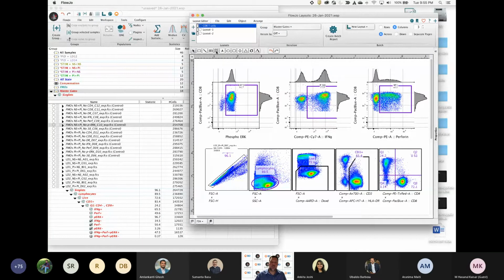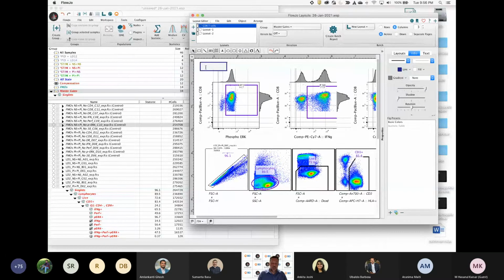And before I do that, I'll just add one more feature here. These are drawing tools in the middle section, and I want to add a text box here. So I'm just going to click the A button, add a text box. And if I type in information, this is my text. It's really small here, but that's just static information within that text box.